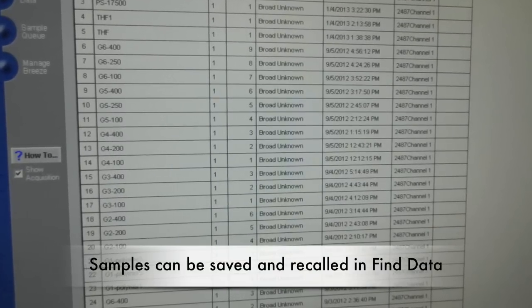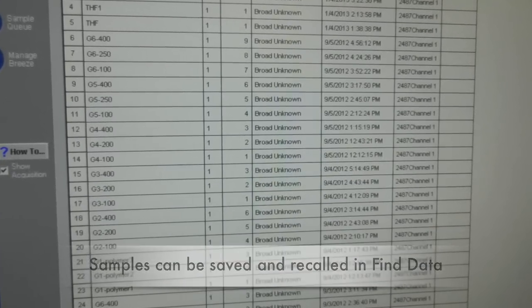Once completed, the sample will be saved within the software and can be recalled in the list provided under the Find Data button.